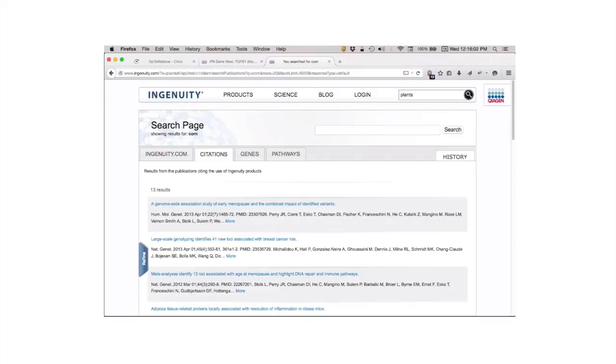So what is the maximum number of gene transcripts in your data set that can be included in analysis? Right. I think it's 8,000 genes is the max you can do in one analysis. The next question is, what's the version of Ensembl gene ID and transcript ID that can be identified by IPA? For example, release 77 or 78? Oh, that question just came up, but I can't remember the answer. We'll send an email back to you. I've forgotten that.